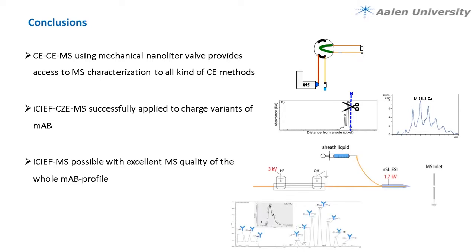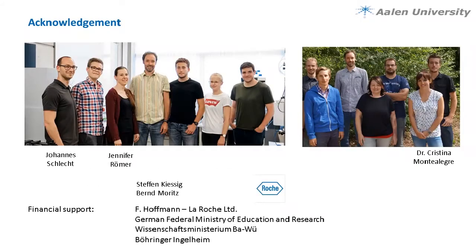But going a step further, if you do a direct approach without a 2-dimensional system, this is possible if you have the right system, which means no additives beyond your ampholytes, and then you get even the characterization of minor isoforms, though we have to improve the separation a little bit further. In total, I would say this is a powerful tool for biopharma, and I guess Carsten will later on give you some more potential applications.